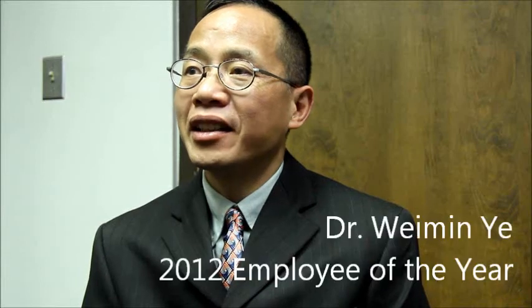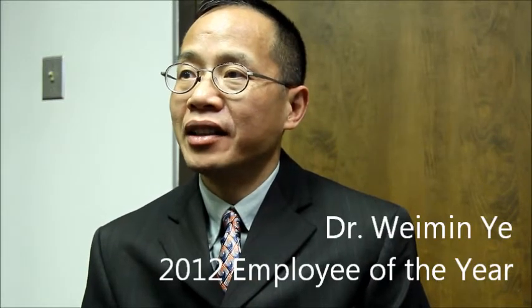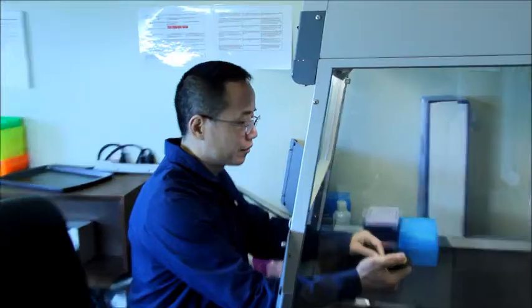I'm Weimin Ye. I'm the section chief and the nematologist in Agronomic Division in the Nematode assay lab.